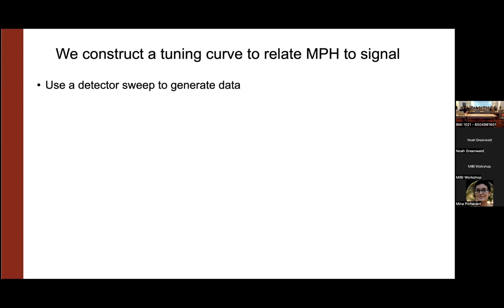So we've identified a metric that we want to use. Now we have to get a ground truth for what this metric looks like. The detector sweep is basically an automatic procedure to slowly increase the voltage and then measure the resulting output on a control sample in a controlled way, so you can understand the relationship between the current voltage and the output.